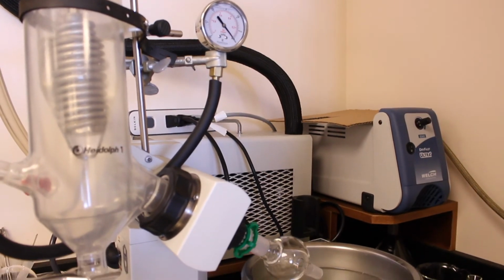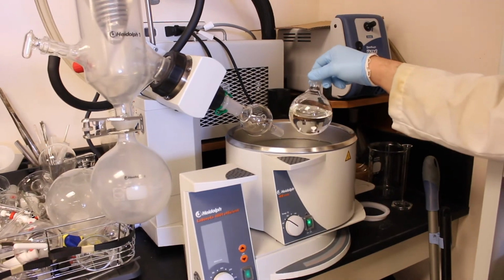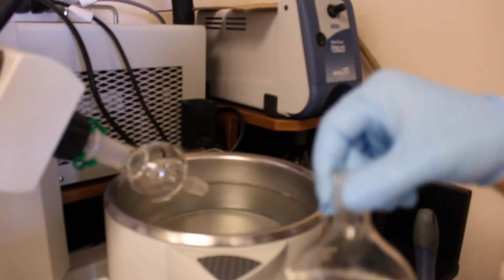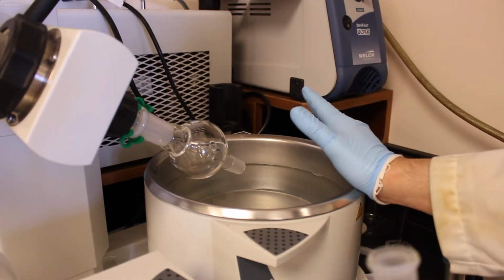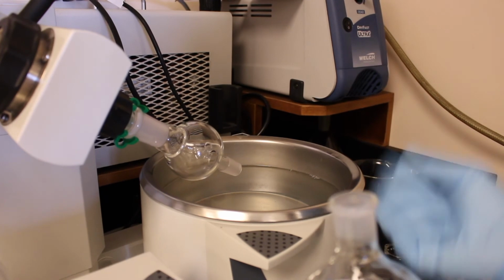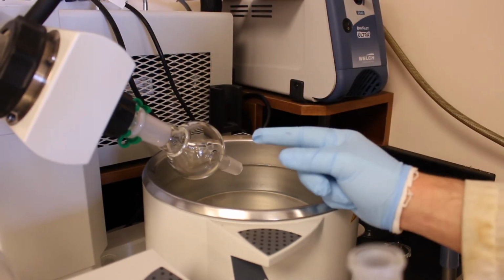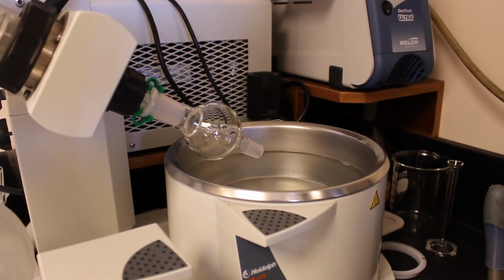Now, the important thing is, let me see if I can grab the flask here. Now, the flask is a little bit above half full, so sometimes on the rotovap you have your flask. Sometimes what will happen is there's called a bump, and a bump is when the solvent flash boils and basically shoots the liquid this way into the rotovap. Now, this is the bump trap, which you can see by its design. Maybe I'll rotate it.